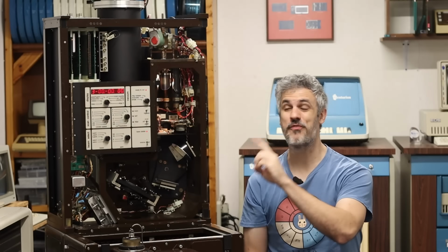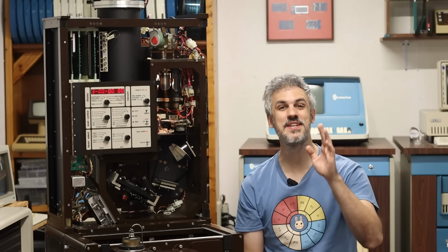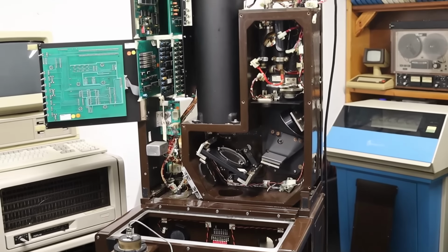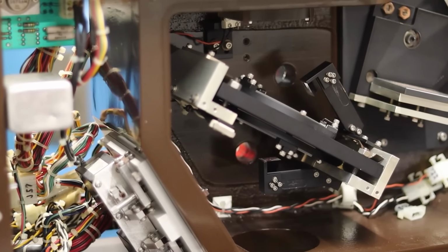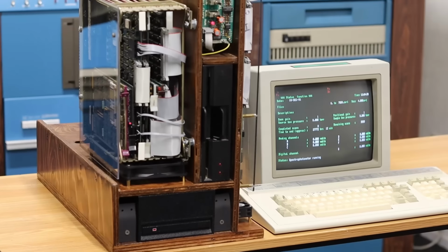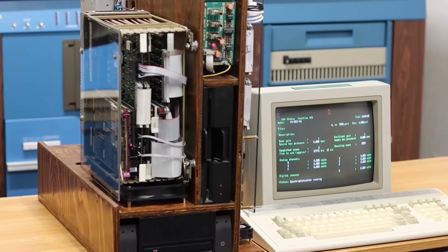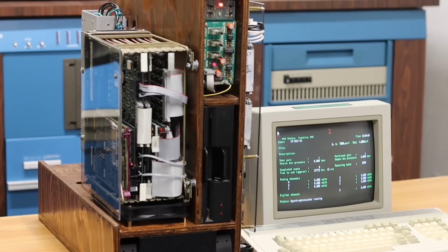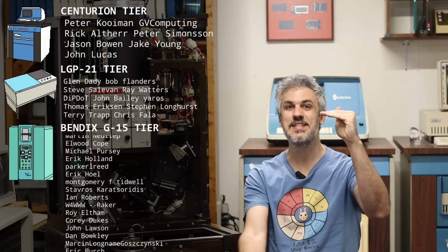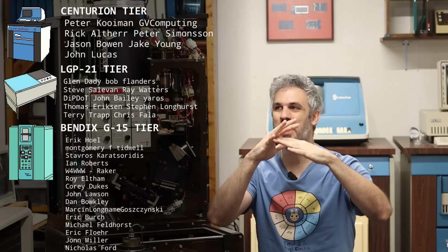This is one of my most favorite things in this room. This is a Bomem DA3 Fourier transform infrared spectrometer. It's from about 1985, and we're gonna get this thing bolted up to a PDP 1173 with a high performance vector processor attached to it. We're getting into the pinnacle of 1980s computing and 1980s scientific research. Like, what a fascinating field to be diving into.